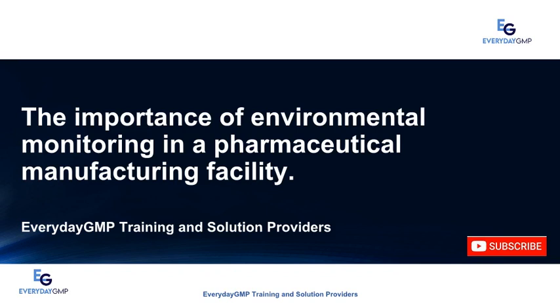and related academia. Today we will discuss the importance of environmental monitoring in a pharmaceutical manufacturing facility. Pharmaceutical companies can play a central role in the digital revolution of healthcare. But capturing this opportunity requires identifying the right initiatives.